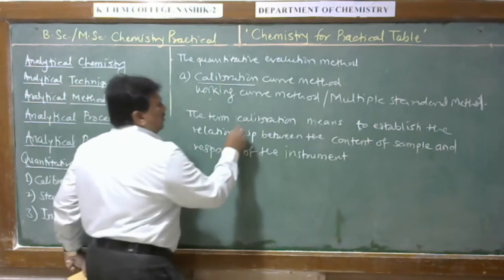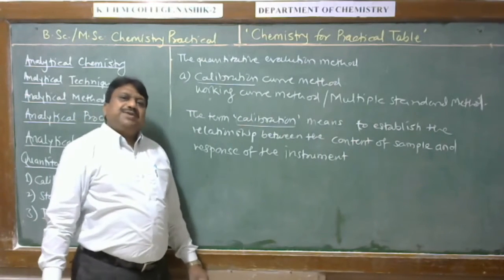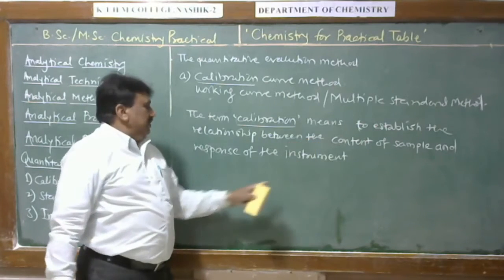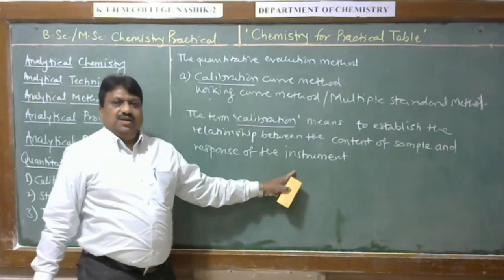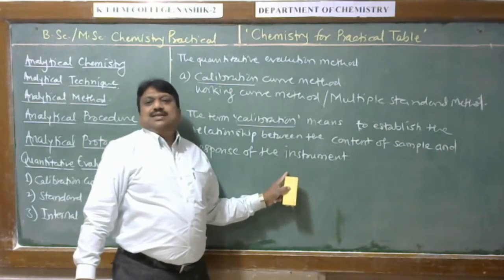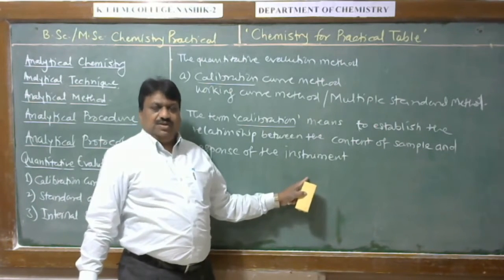Here the term calibration means to establish a relationship between the concentration of analyte, that is the content of sample, and the response of the instrument or instrumental reading. In ultraviolet visible spectrophotometry, we measure the absorbance of the solution for determination of the concentration of the solution.